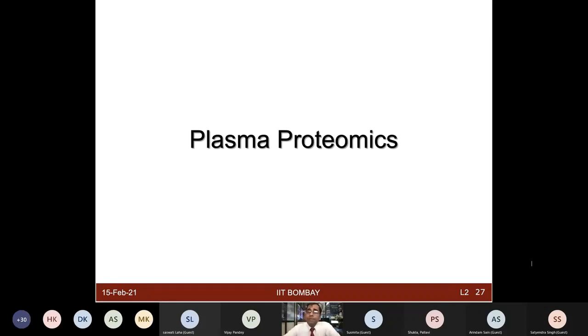If you are working on a challenging sample type, we'll be happy to discuss and deliberate as a group how best to overcome the challenges. Let's continue this interaction, and this lecture will be continued post lunch, where we will talk about other strategies of sample preparation, followed by protein quantification and other quality control checks on SDS-PAGE.